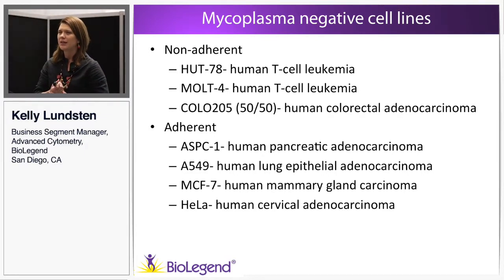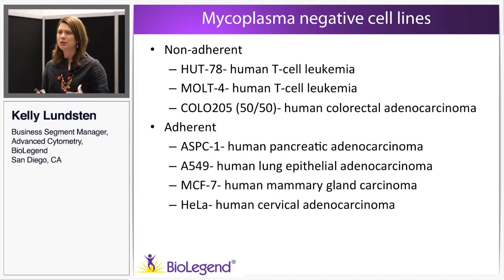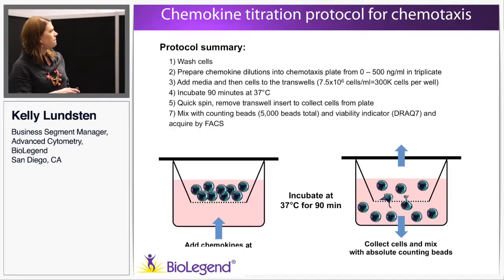And I'm going to talk about the challenge of when you have a human sample like that, dissociating them, treating them. As we all know, chemokine receptors can be extremely sensitive to how they're treated, how they're stressed, what temperature they're at. They can be easily downregulated. So not perturbing an adherent cell line or something in tissue can be very integral to not confounding the data. So I'll go over that as well.